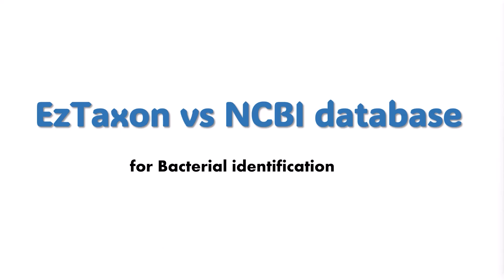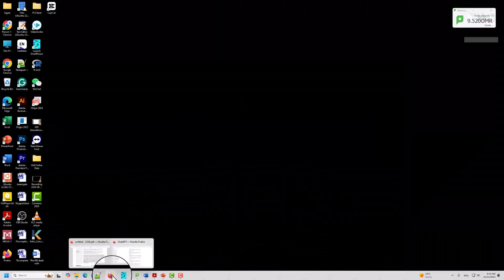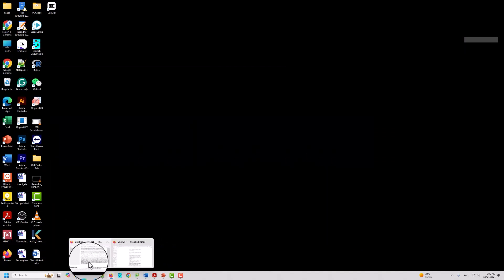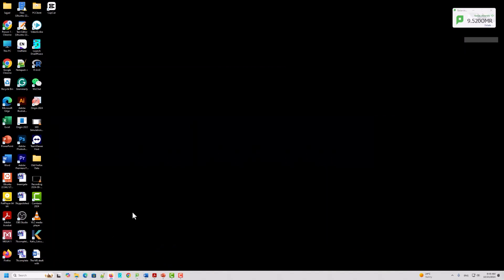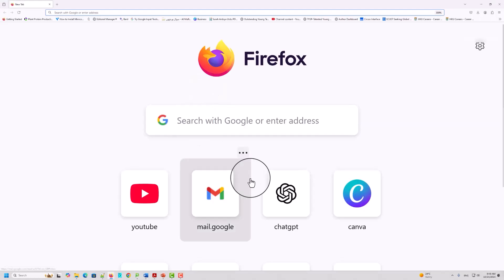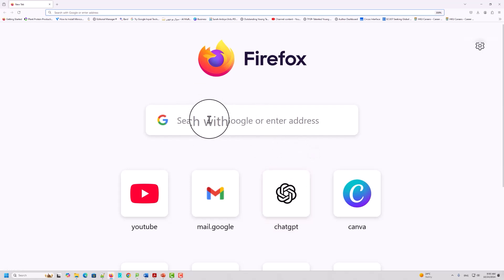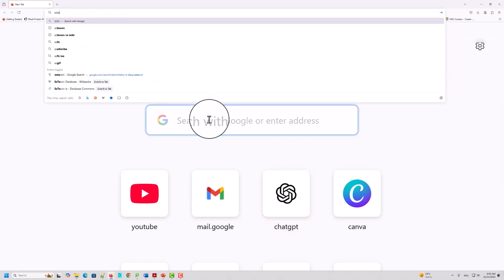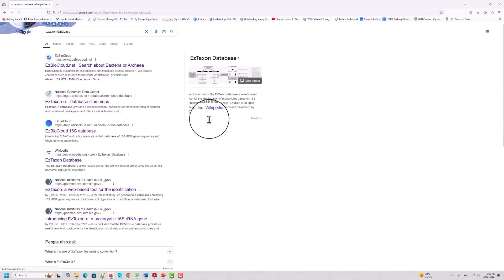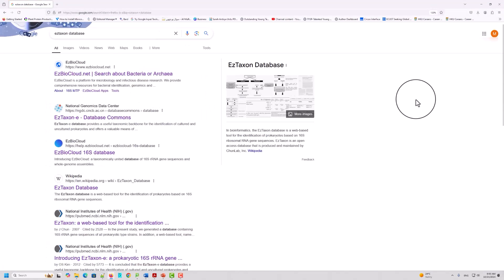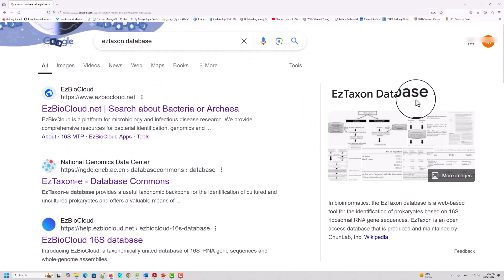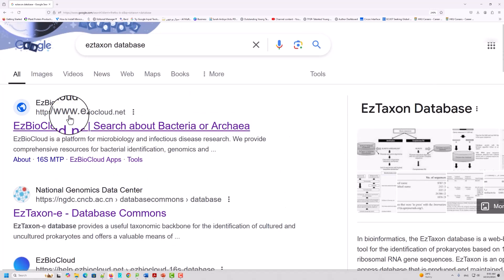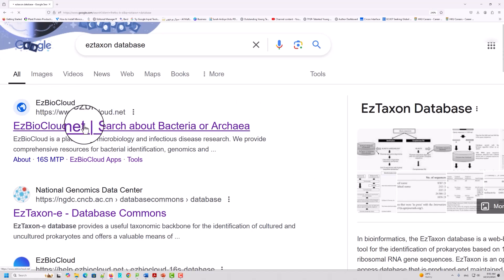Now we will go to the database and see how we can use the EzTaxon database. First, you should open your browser — Firefox or Google Chrome. When you open it, you should search for EzTaxon database. You will see it listed as EzTaxon, which is now called EzBioCloud database. You should click on this database.